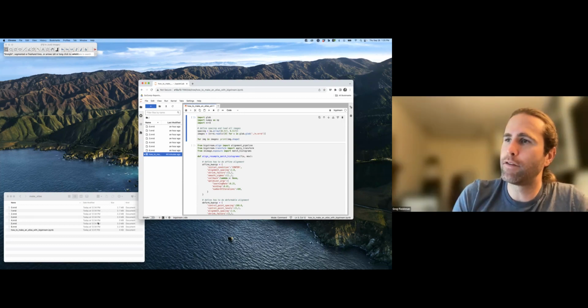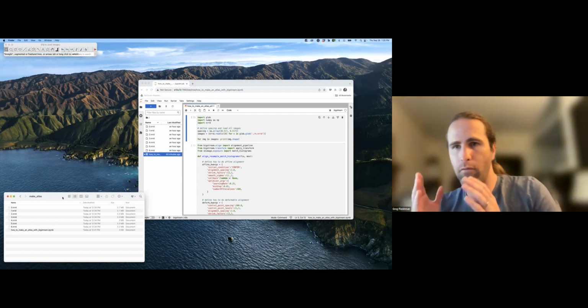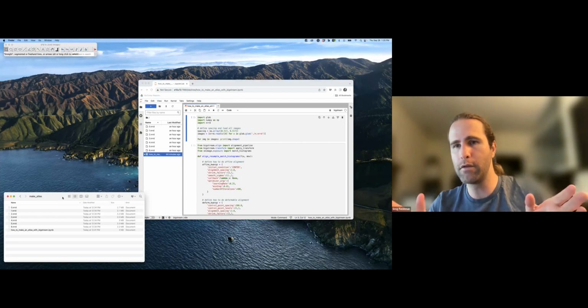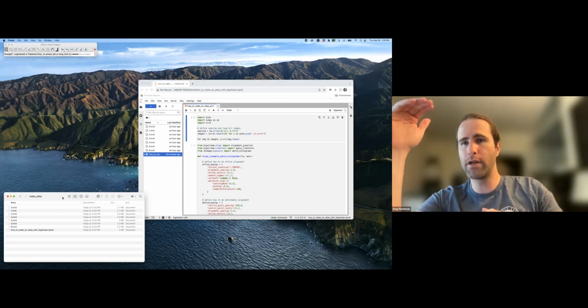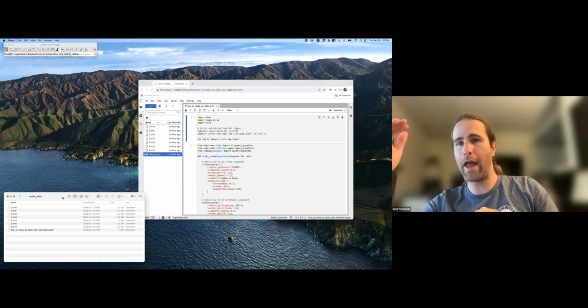Okay, so we got into some advanced conversation about the histogram stuff. Let me get us back to the atlas production stuff. So remember, what we want to do is take a collection of samples, choose one of them, then register everybody to that one example, histogram match all of that, average it, and then repeat.